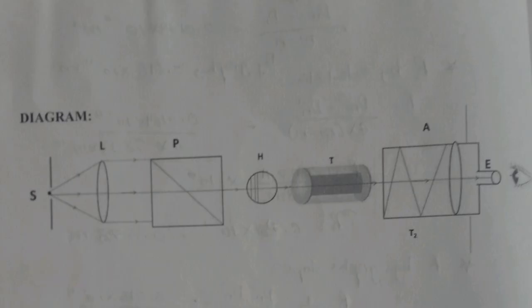The rotation that this causes is called optical rotation, and it depends on many factors, which could be molecule structure, concentration of the substance, light's path length, and other factors. A polarimeter's job is to measure the angle of this rotation by comparing the position of the light before and after passing through the substance.